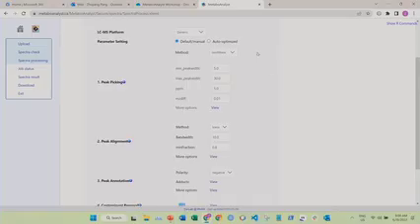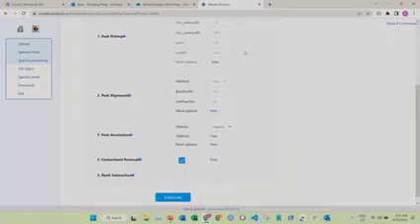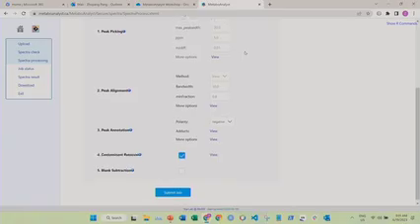Or if we are just a clinician or something, we don't have too much experience, we use the auto-optimized. MetaboAnalyst will optimize the parameters for you. It's going to be the optimal one, and you can view the results later to compare them.